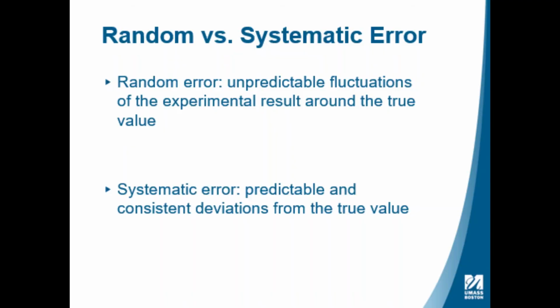Both crude melting points were within 1 degree of their literature values with a range of about 2 to 3 degrees each. The pure melting points were about 1 degree higher with the same range. This consistency in the difference between the crude and pure melting points of two very different compounds leads me to believe that the discrepancy could be due to the melt temp not being calibrated rather than impurities, especially due to the perfection of the naphthalene crystal morphology. This would mean that the error in the melting points is probably a systematic error rather than a random error.